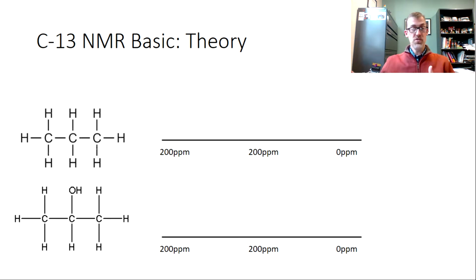But if we move the other direction, which is where we're going here, the energy goes down. And so if we move out of the red end of the visible spectrum, we get to infrared light, and infrared light has enough energy not to really promote electrons, but to cause electrons involved in bonds to vibrate. So we think of that as heat energy. We go further, we get to microwaves, and eventually we get into the radio frequency range of the spectrum, and that is the part of the spectrum that NMR takes advantage of.